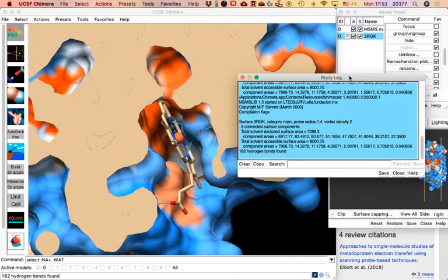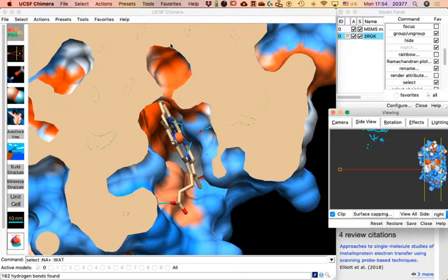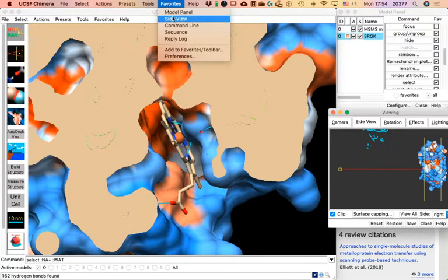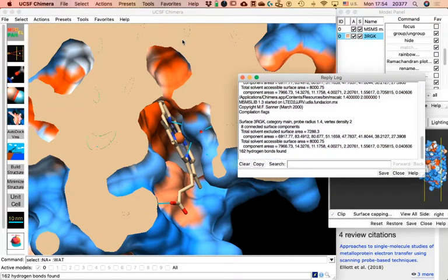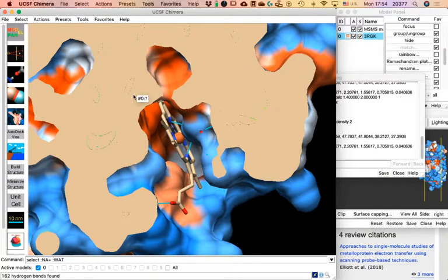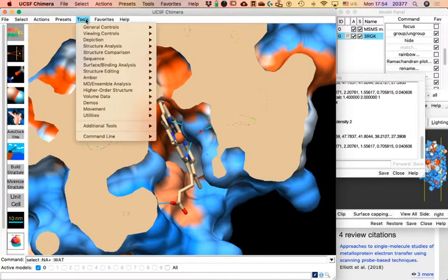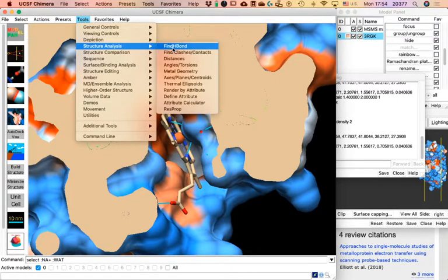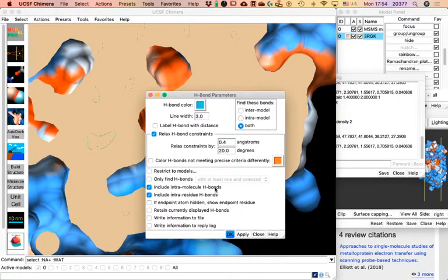Is everybody totally lost? If you couldn't get the hydrogen bonds, the Reply Log is the way to see the information. If you don't see it there, go to Tools > Structure Analysis > Find H Bonds, leave the settings as default, and click Apply.